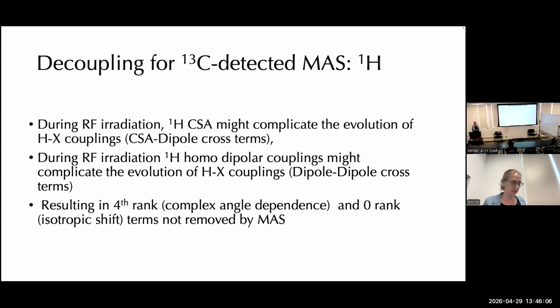One thing that's gotten a lot of attention in the literature from within those problems is the interaction between the proton CSA and the HX coupling. That particular term, that particular cross term. During RF irradiation, the homonuclear proton couplings are also a known issue.